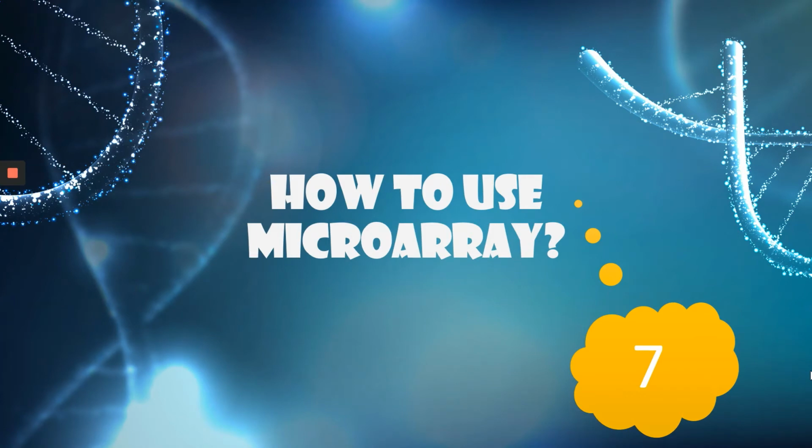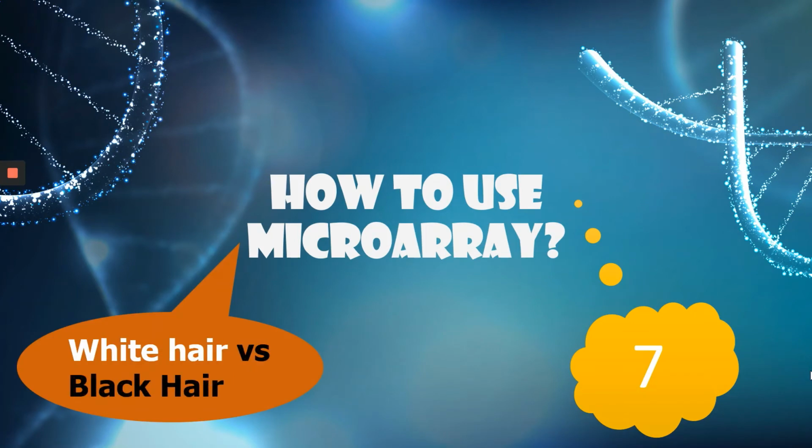So Sarah, what experiment do you want to do today? Do you know what microarrays are used for? So a basic experiment that we can do is white hair versus black hair. So we want to know the genes that express. The expression of genes is one of the uses of microarray. So we want to know the genes expressed in the white hair and the genes expressed in the black hair. So how do we do these experiments of the microarray?